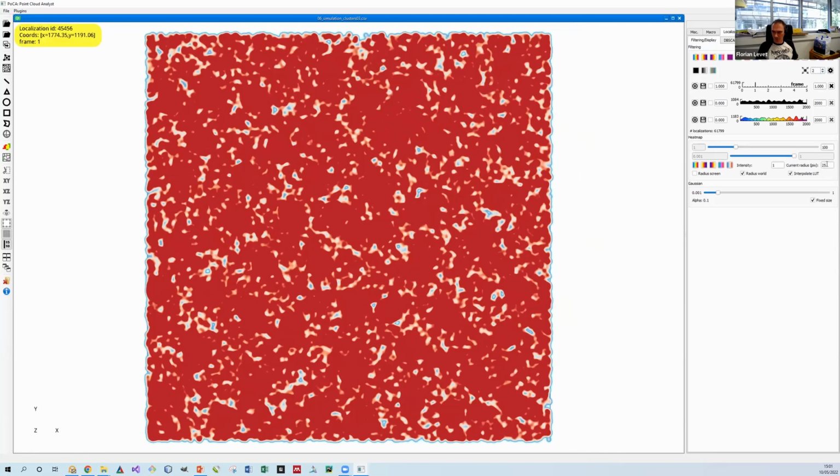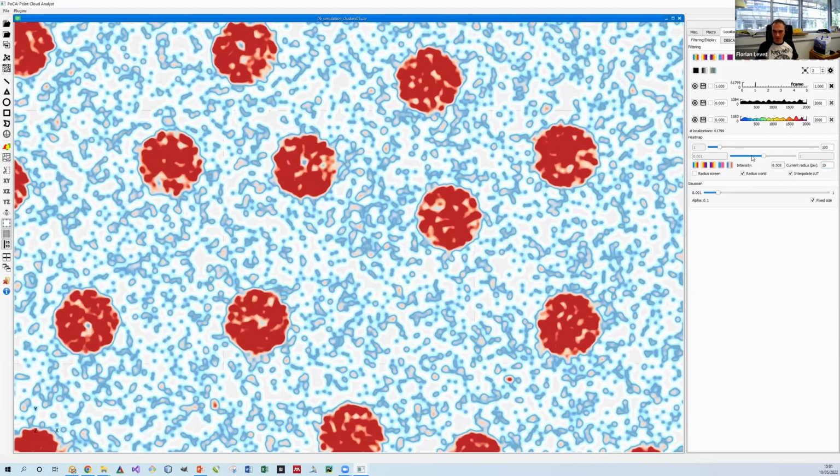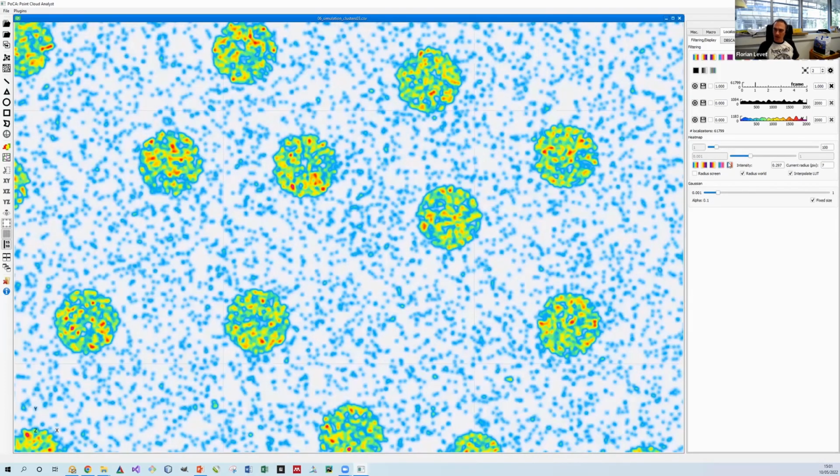In this case, the radius is a little big. So you can see that you have a different visualization. It's really a heat map, so you can change the LUT and play on the alpha or the radius of your heat map in order to have a different visualization. And this one is Gaussian, but I will show it in 3D as it's better in 3D.